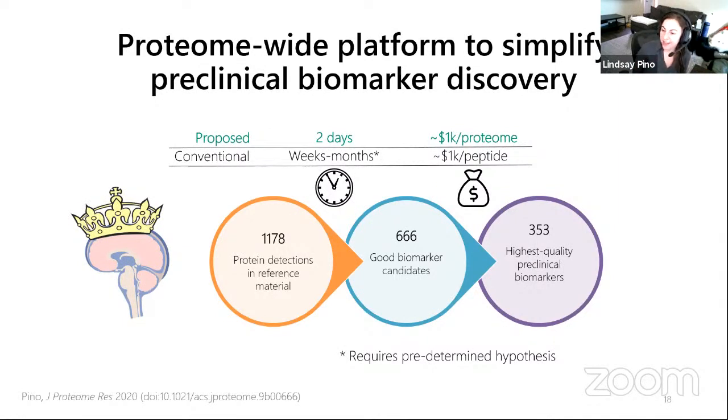So if each individual peptide has its own variation, is this taken into account during quantification in the case of shotgun proteomics? As far as I am aware, there is no algorithm out there that really takes into account that different peptides have different LOQs. I think most protein quantification, you'll be learning more about this later too, the most common way people do it is literally just summing peptides to get a protein level quant.